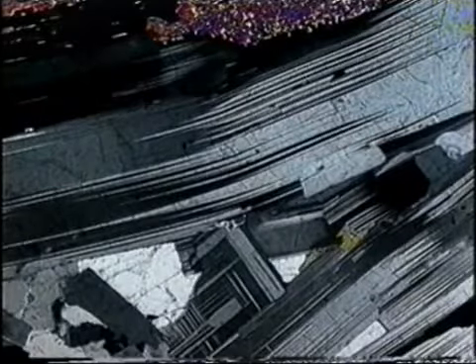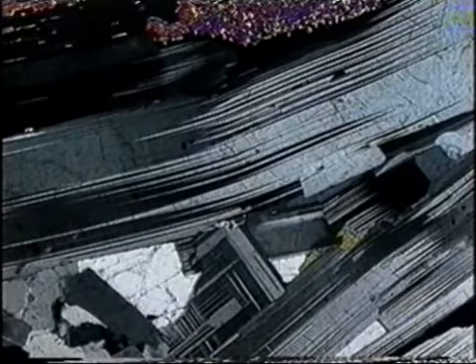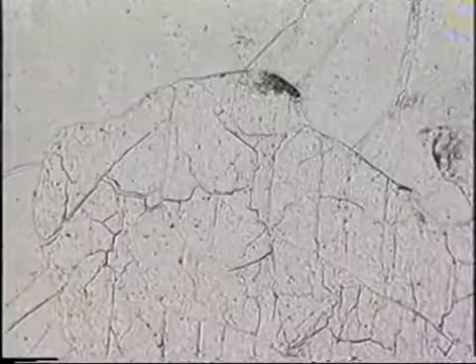Twin lamellae are commonly bent and tapered due to plastic deformation. More tapered twin lamellae, typical of secondary deformation twins. Plagioclase more calcic than about An25 has higher relief than quartz. Note the Becke line moving into the plagioclase from quartz near the top.